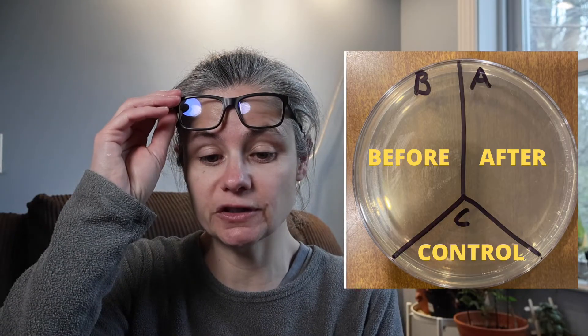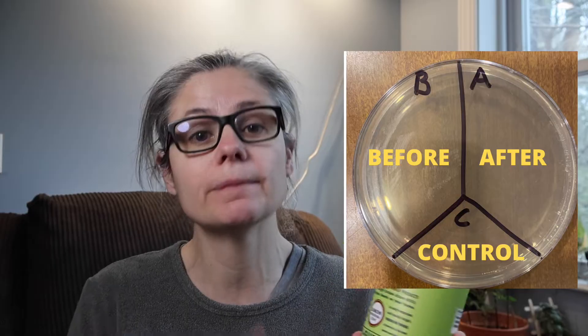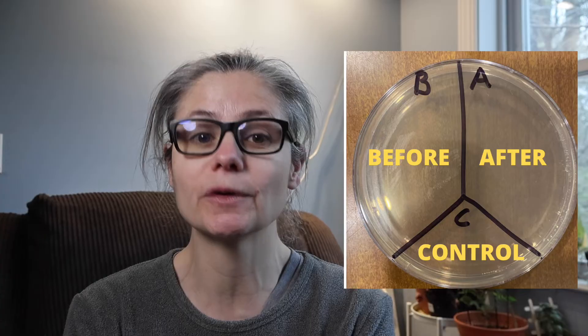Those directions state: simply spray and wipe away. So there'll be no dwell time on this. A lot of times when I'm testing a product that claims to be a disinfectant or a sanitizer, there'll be a 30-second to 5 or even 10-minute wait before I'm supposed to wipe it clean. However, this just says spray and wipe, so that's exactly what I'm going to do. After I'm done wiping, I'll take a second sterile swab, swab the area again, and place that sample on the petri dish in the area labeled A for after. C is my control — nothing's going to go there. So let's see how well Mrs. Meyers can remove bacteria from my home.